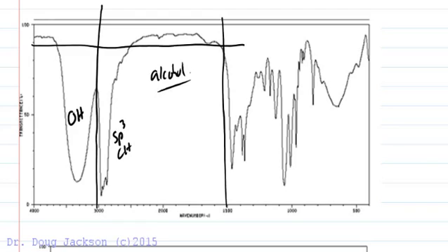We can't tell what else is on the compound until we get to NMR but we know it's all alkyl groups and OH. It could be a halide, or at least halides and ethers are IR silent so we wouldn't be able to see them if they were there, but we at least know that we have an alcohol for this particular spectrum.